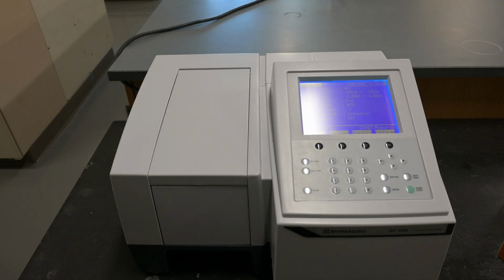So this is the part of the video where I normally do some analytical methods to show what I made is what I said I did. But it's an orange powder, and I can prove that it's orange. Using a device known as a UV-vis, we can look at the wavelengths the compound absorbs at and tell a lot of information about the compound.